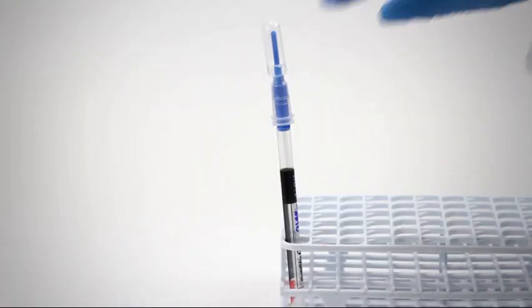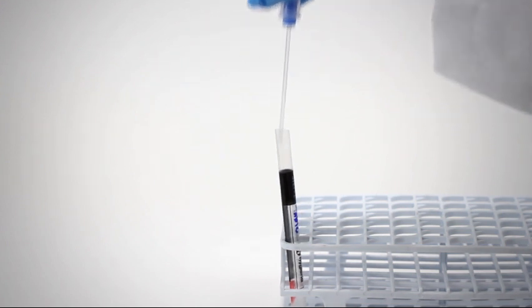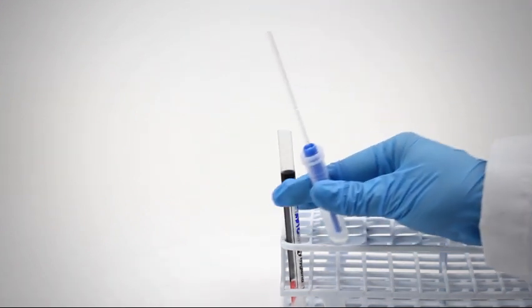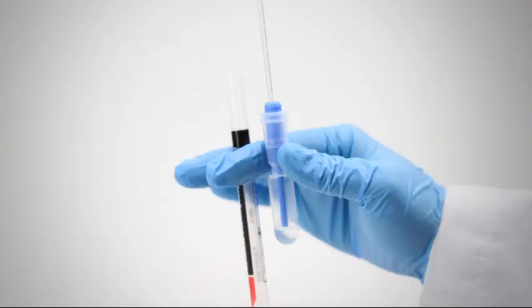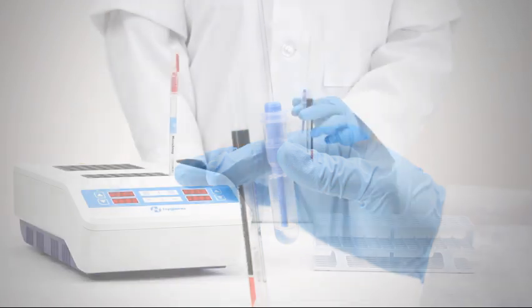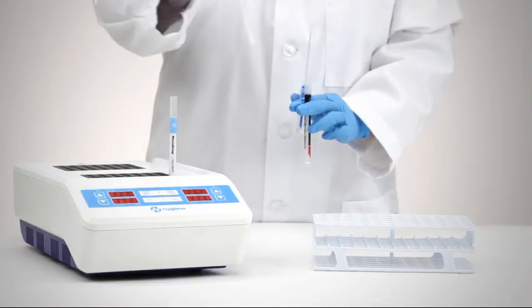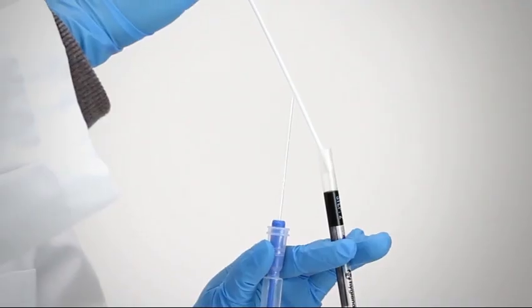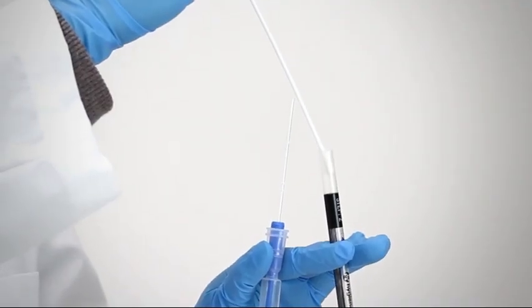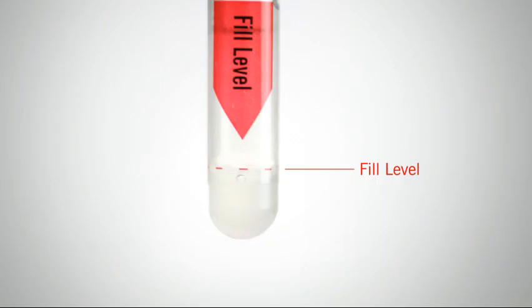With one hand, carefully grab the detection device bulb with your thumb and forefinger. Then, using your forefinger and middle finger, grab the detection device tube. Using your other hand, transfer the enriched sample from the enrichment device to the detection device. The detection device has a fill line marked on the bottom of the tube. Fill to this line.